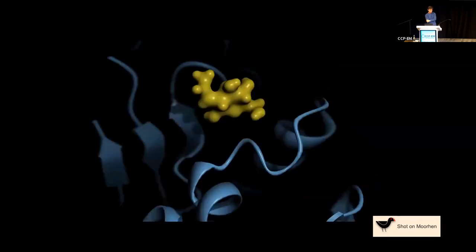So for instance, you could be looking at a ligand like this thing here. For this ligand, I'm using some sort of blob representation colored in yellow. And then we have the structure in these blue ribbons. And there are several things going on. Actually, we have depth blurring as well. So you may notice that the beta sheet on the back is sort of blurred. That's because it's far away. So that helps give the user this sort of perception of depth. And then we also have shadows being cast by the ligand on that beta strand on the back. So there are several things going on that make sure that the picture actually looks nice.